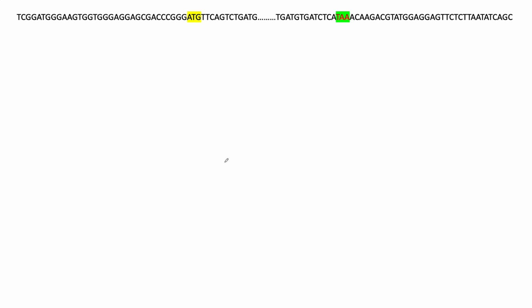Okay, in this video, what I'd like to do is a couple of things. The first is to show you how to properly design primers, and then the second one is to show you how a PCR reaction takes place, to show you the products that are formed in the first 3 or 4 cycles. And the reason I want to show you that is because I want to show you how primers and the restriction sites that you add to primers can be incorporated into the PCR product.